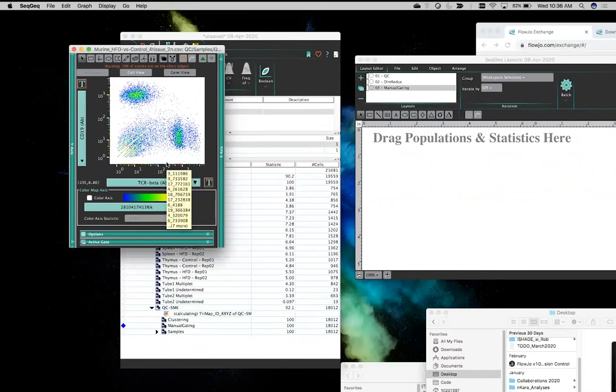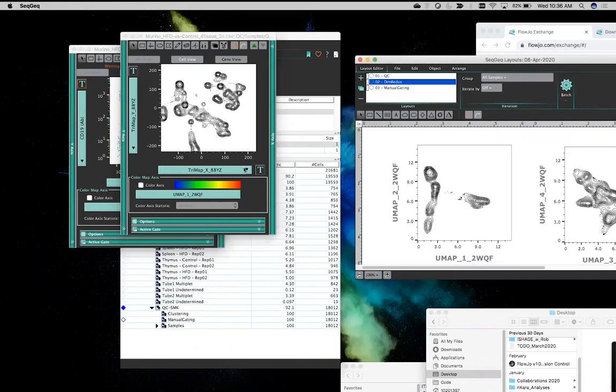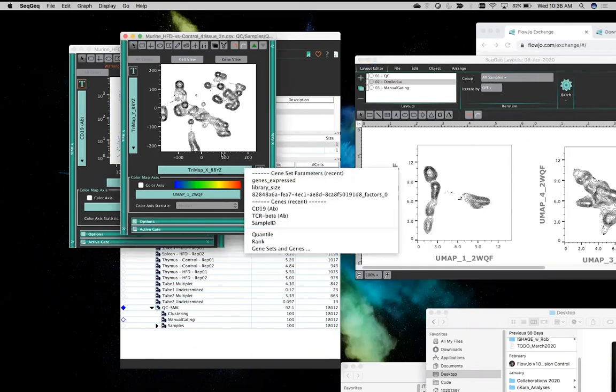That's because they're the same parameters that you would see in flow cytometry, except we didn't have to worry about any compensation. And we're able to multiplex way more parameters. In this case, we're already adding just in a small multiplex 30 parameters. So that's pretty awesome. Okay, before I can even draw a gate, we've already developed our dimensionality reduction. So you can see TriMAP is quite fast.